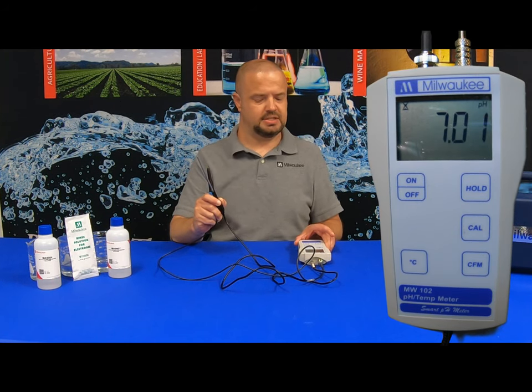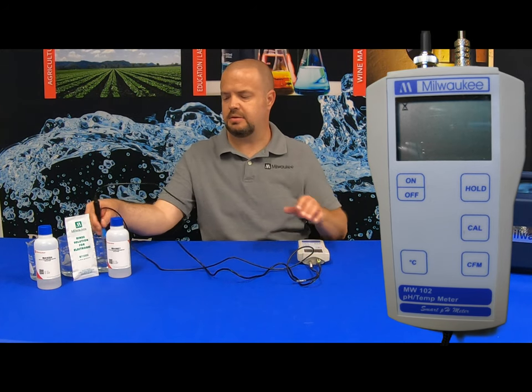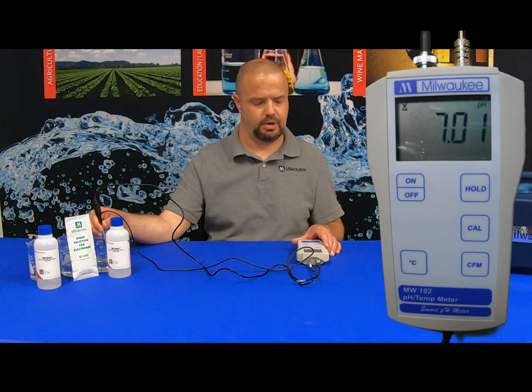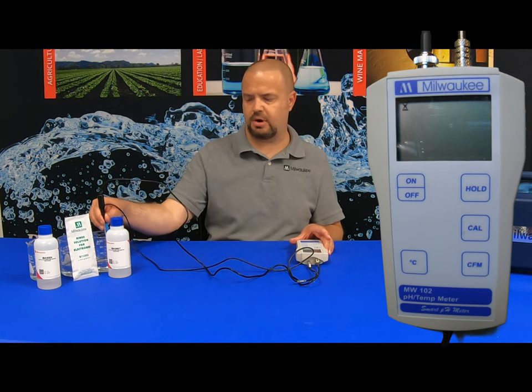It's going to display 7.01, which is indicating to place the probes in the 7.01 buffer solution. Stick the probes in. You'll notice a small pH icon flashing in the upper right-hand portion of the screen. We want this pH icon to stop flashing before pushing the CFM button to confirm calibration. Once it has stopped, hit CFM — that's confirming the 7 calibration.